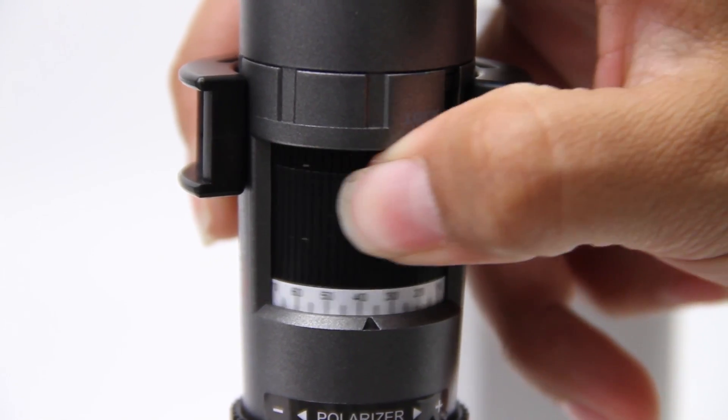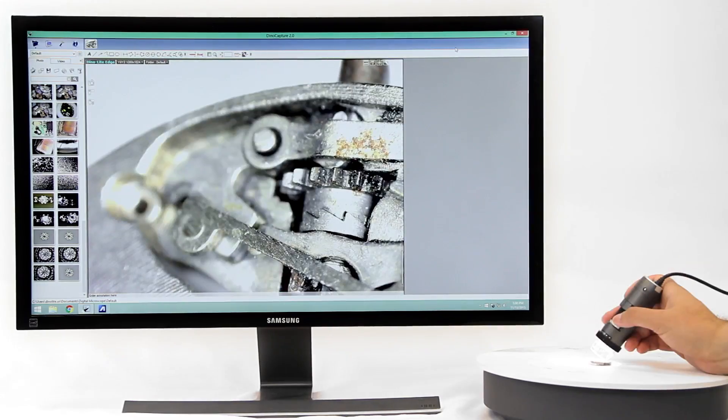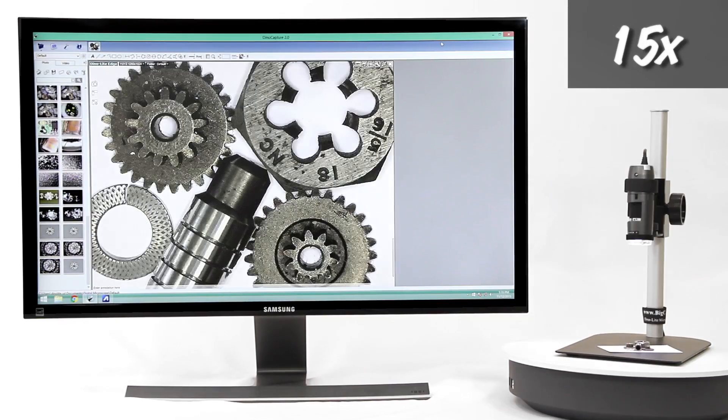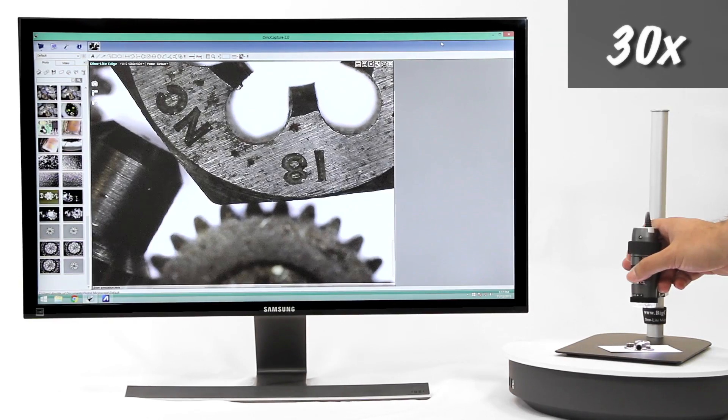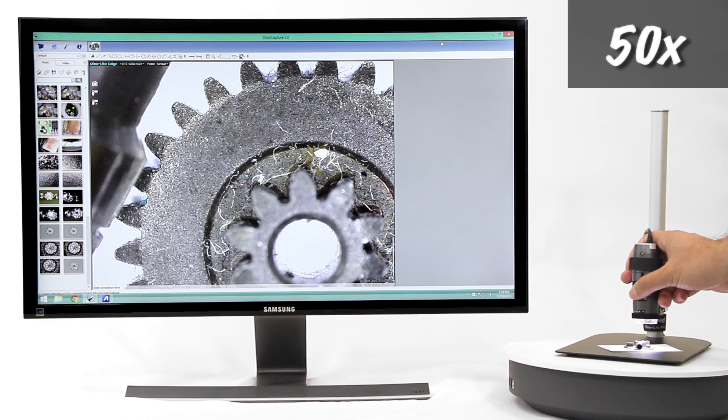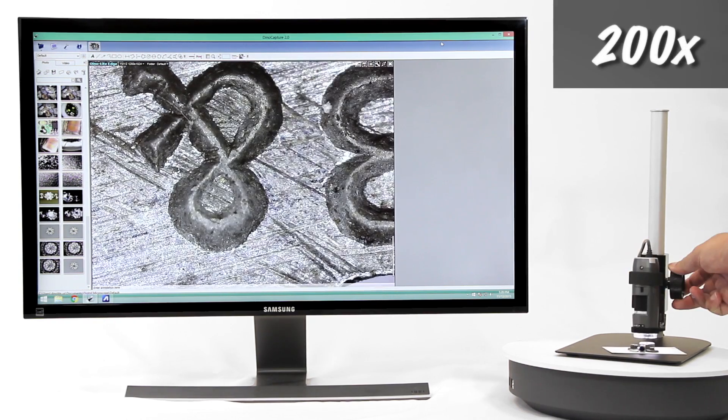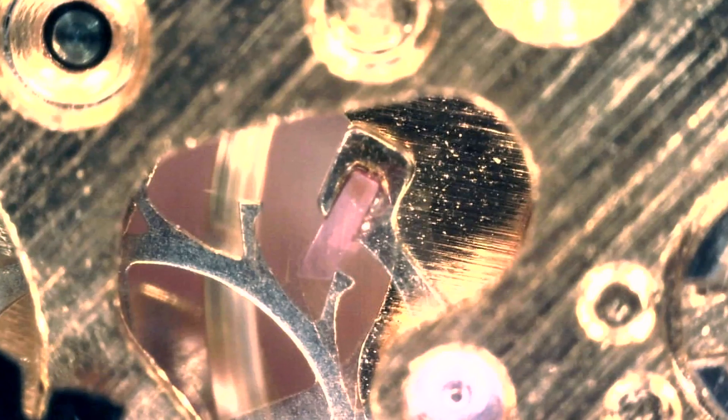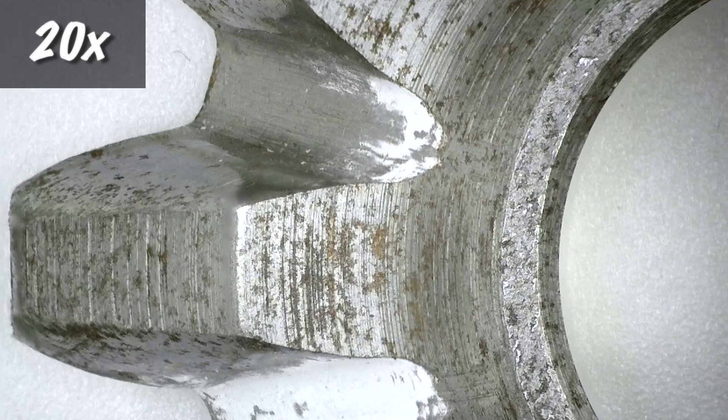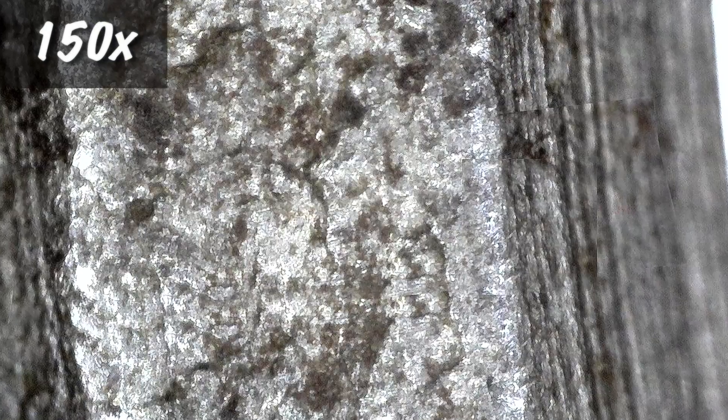These microscopes will focus at a specific distance and magnification from the object. For example, if a Dynolite is moved away from the object and broadened to focus, the image will have a larger field of view and a lower magnification. Bringing the Dynolite closer to the object will focus with a smaller field of view but a higher magnification.